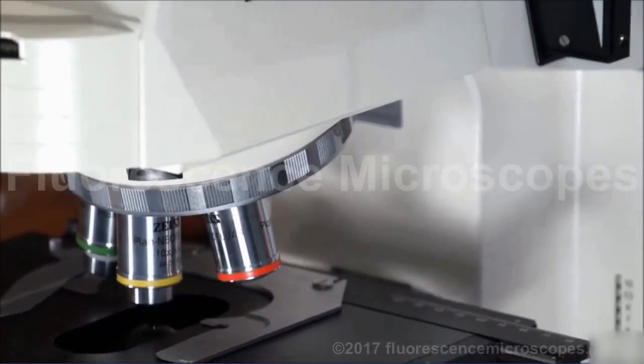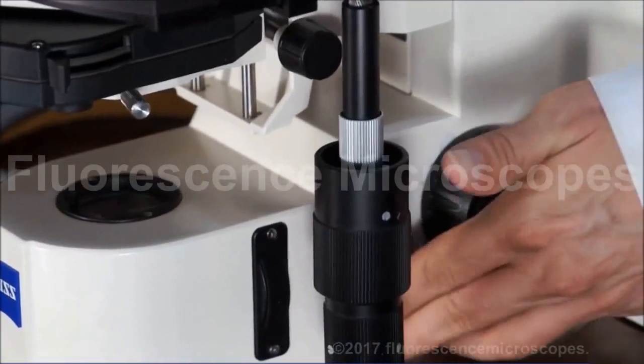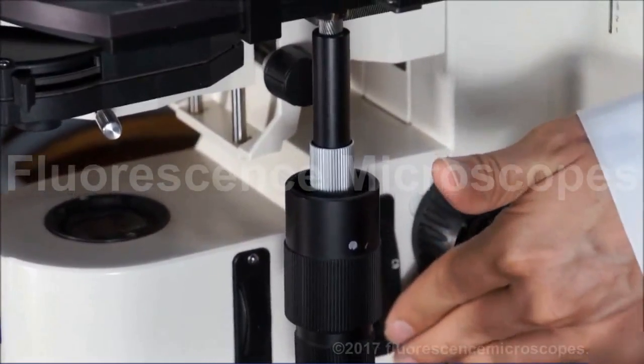You've got some neutral density filters on the side. You can use those in conjunction with each other.